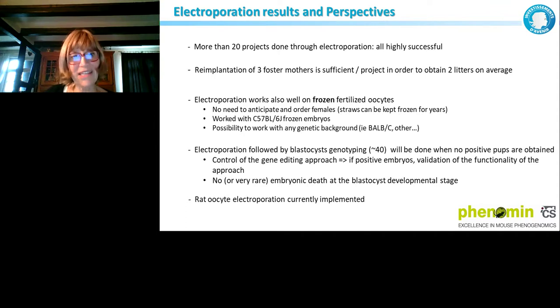It should work in any genetic background. It works also really well in B6J genetic background. All of the projects I showed you in mouse are done in B6N genetic background. Sometimes we need to do that in B6J. But of course, it also works in BALB/c and so on.